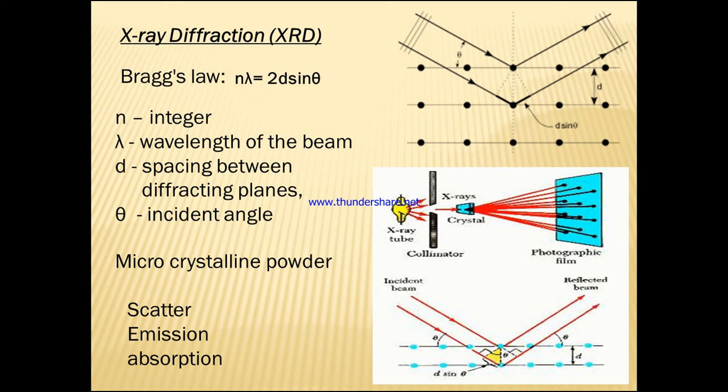These spectra consist of several components. Copper is the most common target material for single crystal diffraction. In the same way, these X-rays are collimated and directed onto a sample. As the sample and detector are rotated, the intensity of reflected X-rays is recorded. The geometry of the incident X-ray impinging on the sample, and the detector rotation, is such that the reflected X-ray is recorded here.